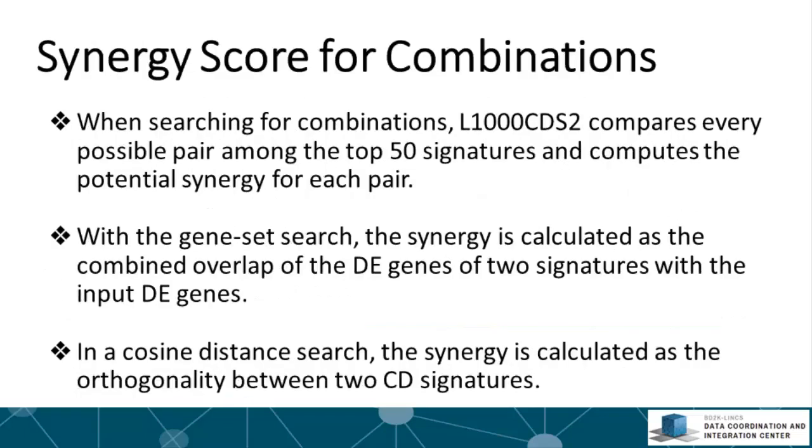For the search for combinations, a predicted synergy score is computed. To do that, we compare every possible pair among the top 50 signatures and compute the potential orthogonality of those pairs. When we are looking for pairs when the input is a gene set, we just combine the overlap of the differentially expressed genes of the two signatures with the input differentially expressed genes.